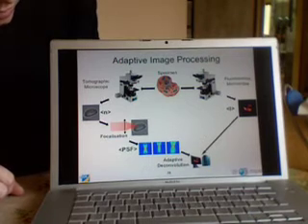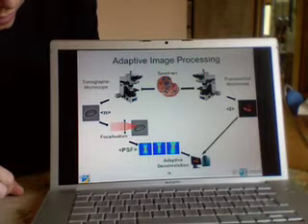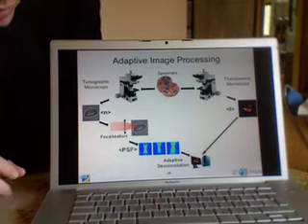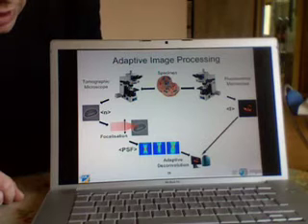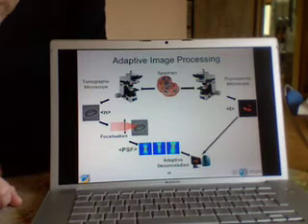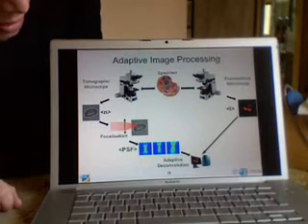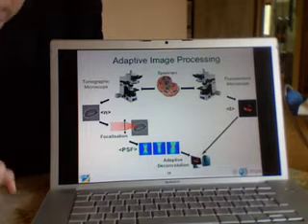Cool. And the tomographic microscope was originally proposed in the 1960s, by Emil Wolf in '69, but obviously at that time lasers were hardly available, and computers were not available. Nowadays we have computers which permit us to process huge quantities of information to compute and reconstruct 3D images.